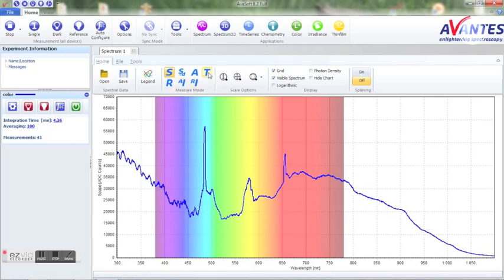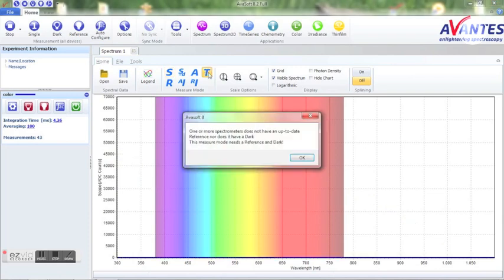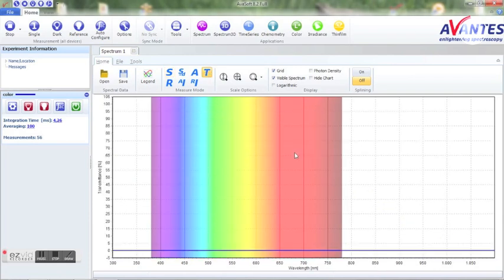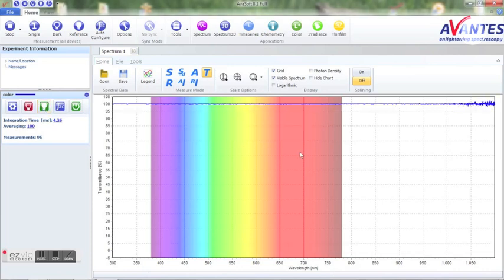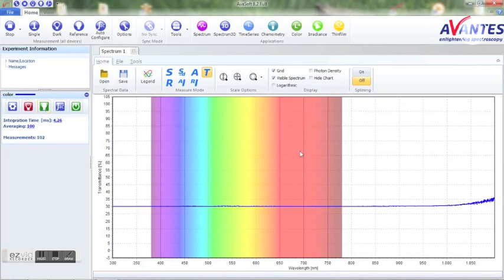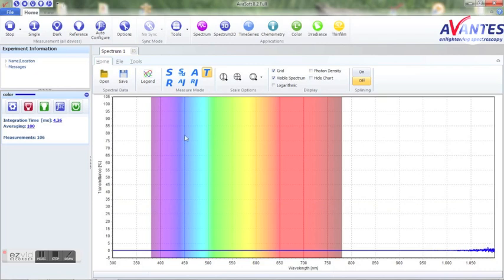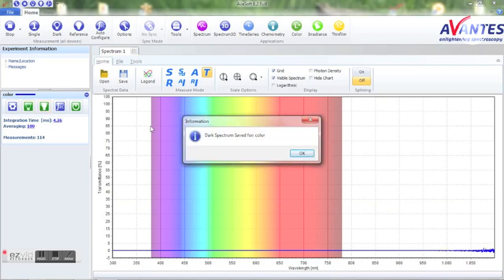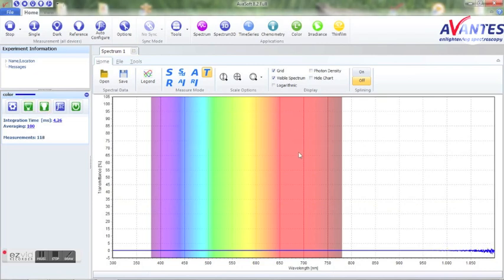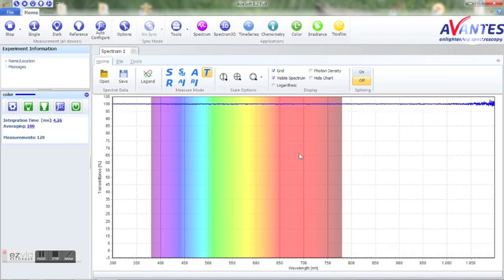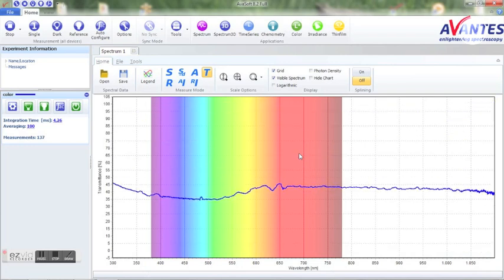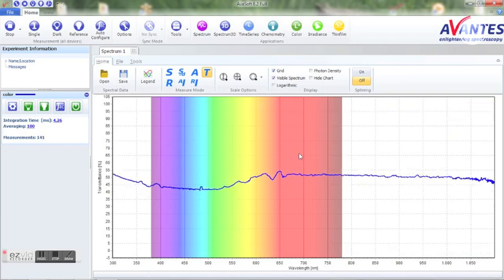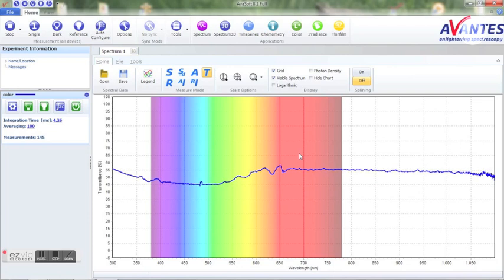Switch to the transmission mode T, press start and take a white reference to determine the 100% transmittance line, and take a dark to determine the 0% line. You will see that the buttons turn green once a reference has been taken.